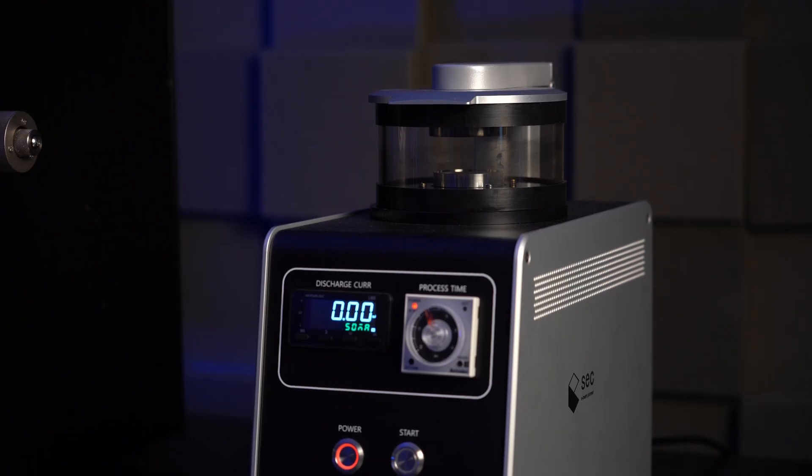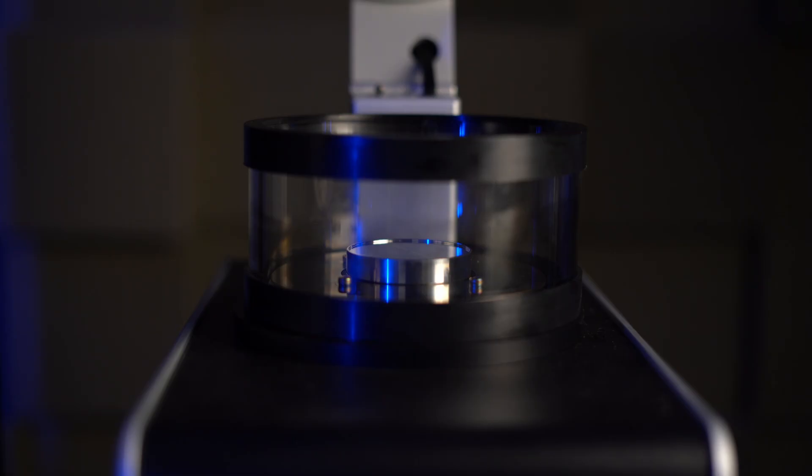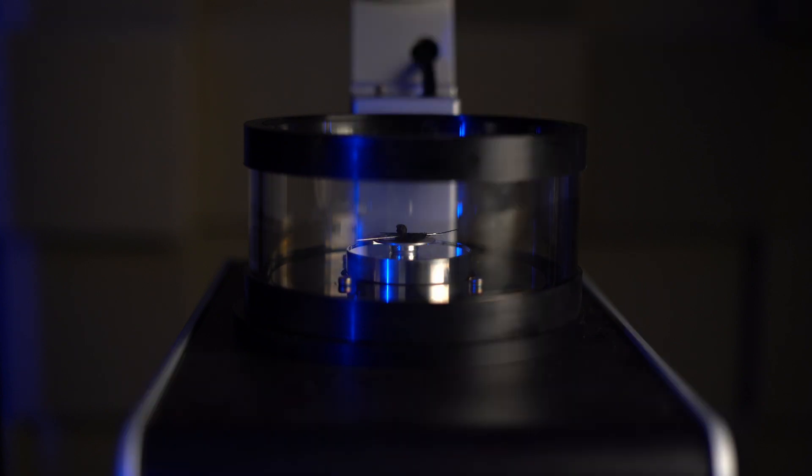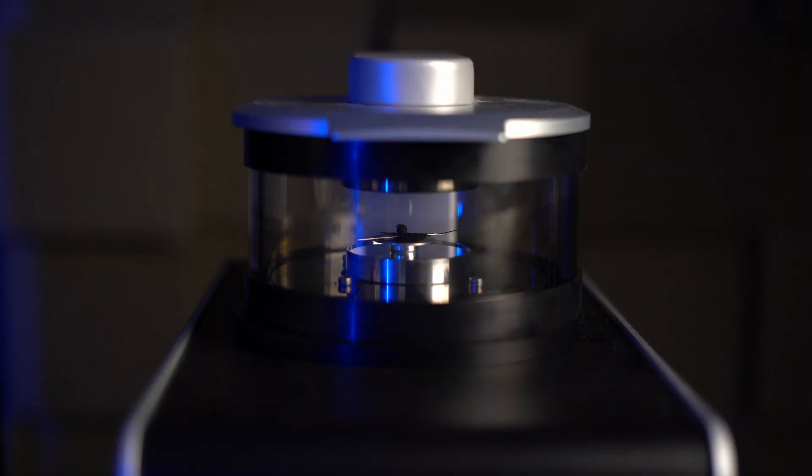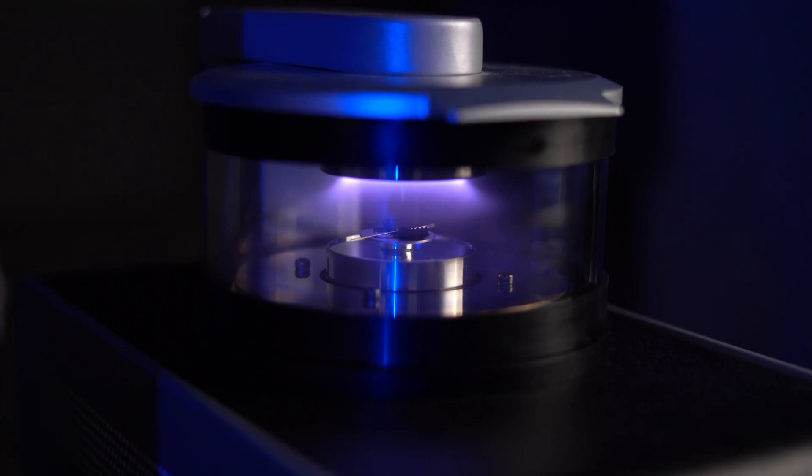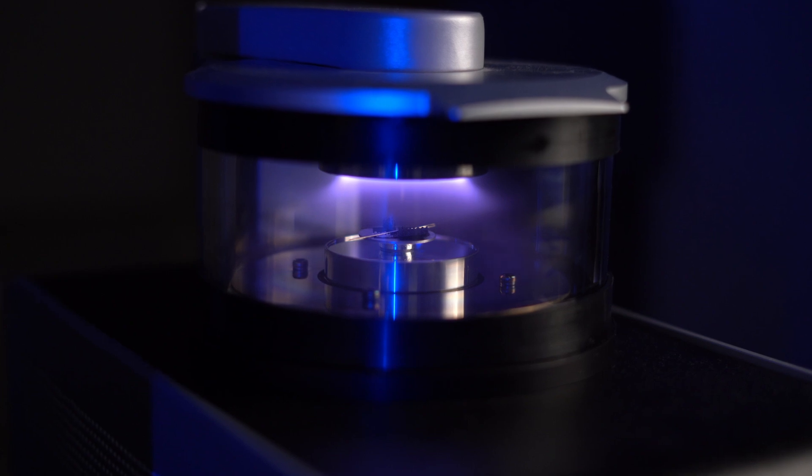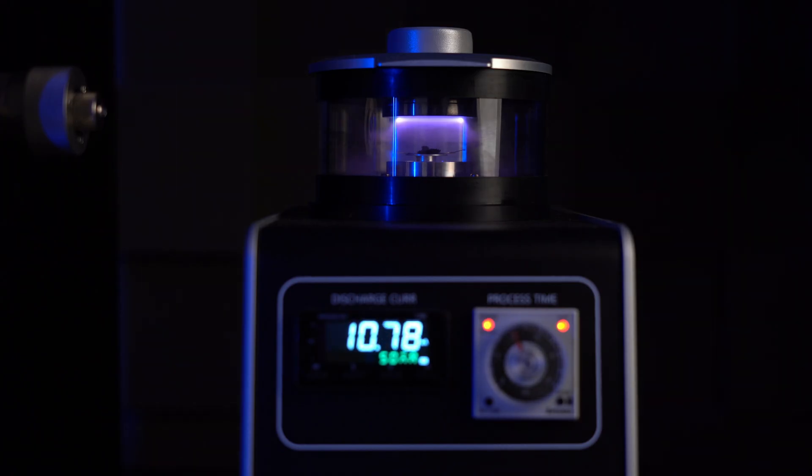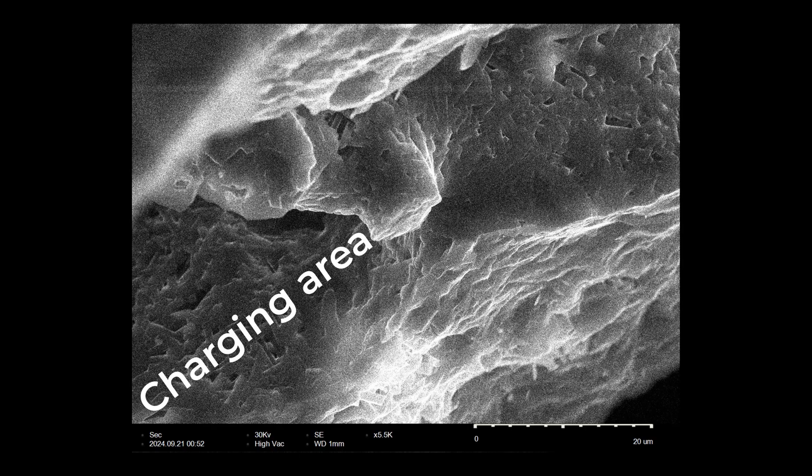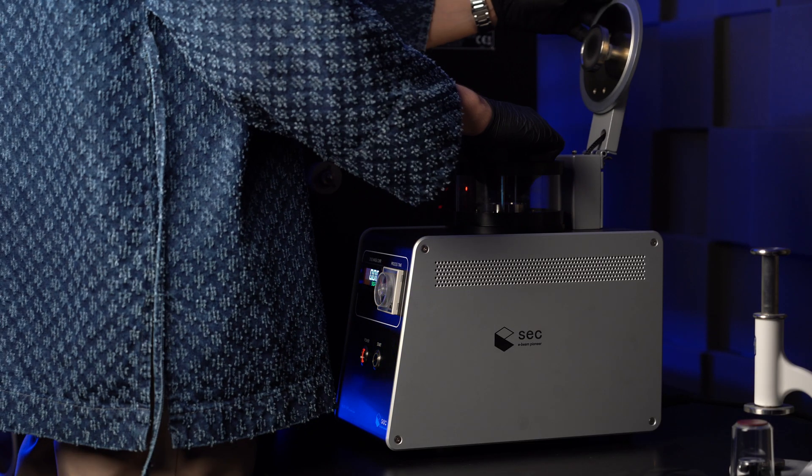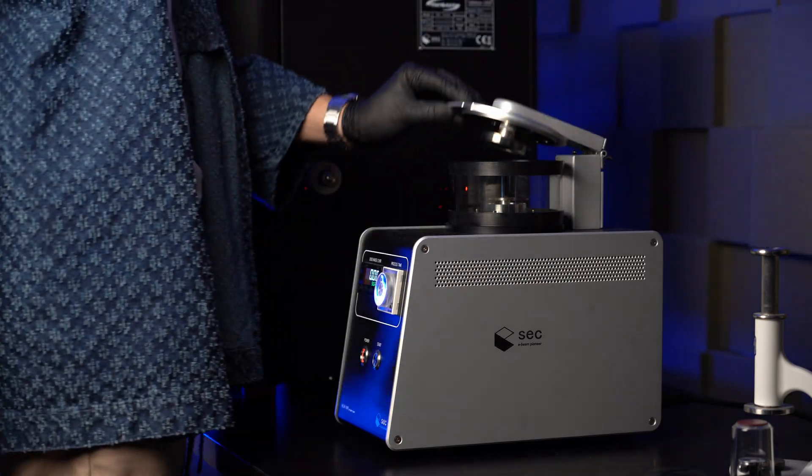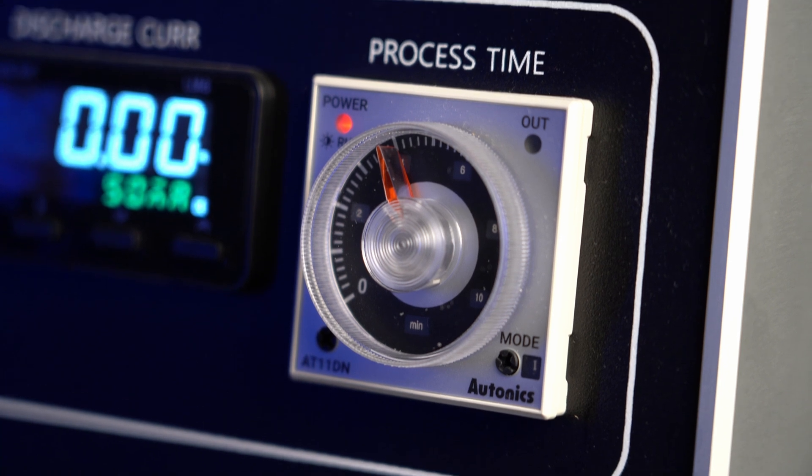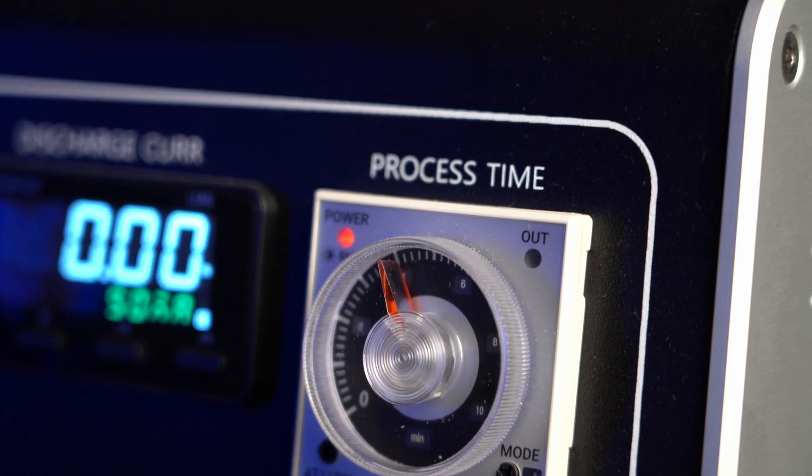We have an ion sputter coater nearby. We need to coat nonconductive specimens with a nano layer of metal or carbon. In our case it can be gold or platinum. Carbon coaters are different. This coating prevents the sample from being charged by electron beam. In this MCP100 coater we can control the coating thickness only by coating time. This old-style timer is absolutely ideal for this.